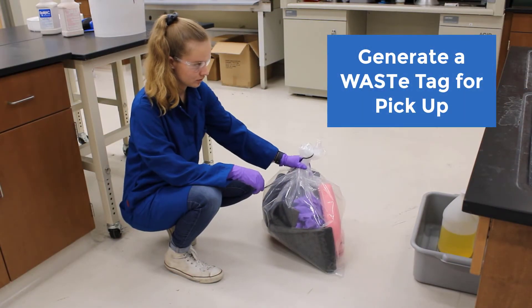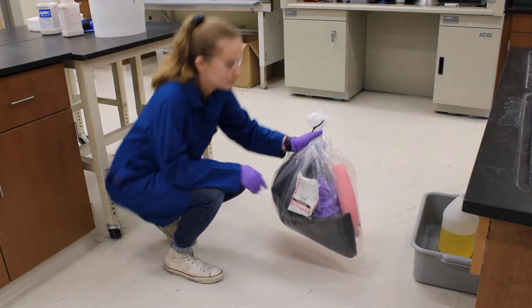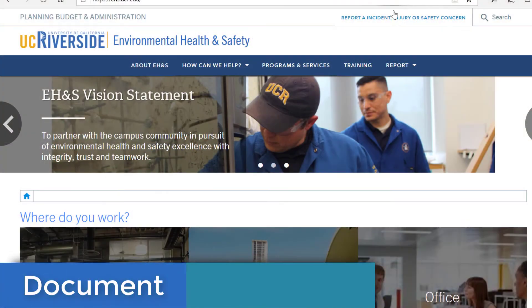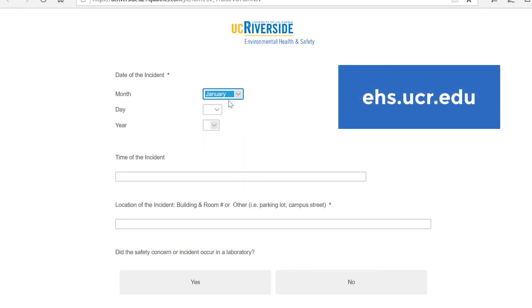Next, create a hazardous waste label using Waste-D. Place it on the bag and store in an appropriate secondary container in the waste accumulation area for pickup. The last step is documentation — be sure to notify your PI or department of the incident and complete an incident report at ehs.ucr.edu.